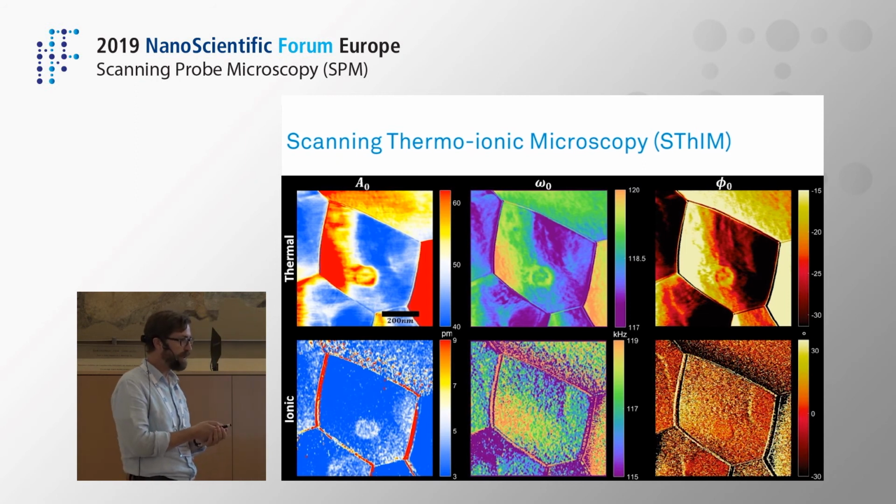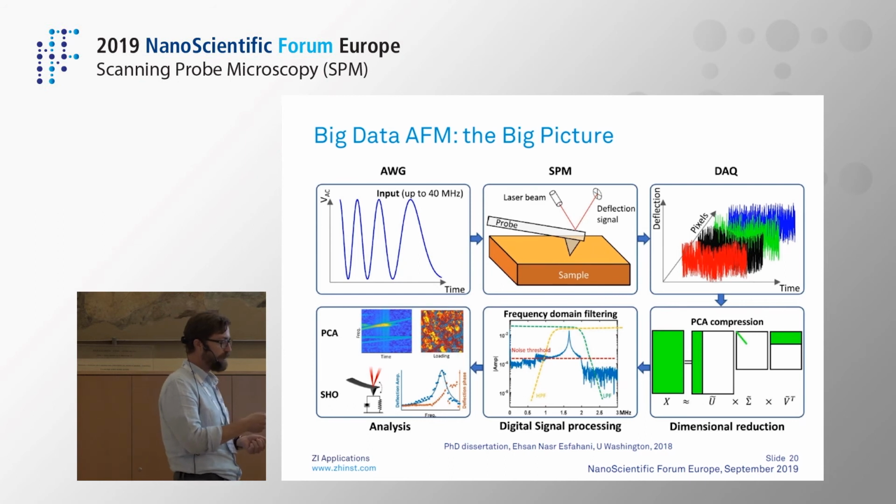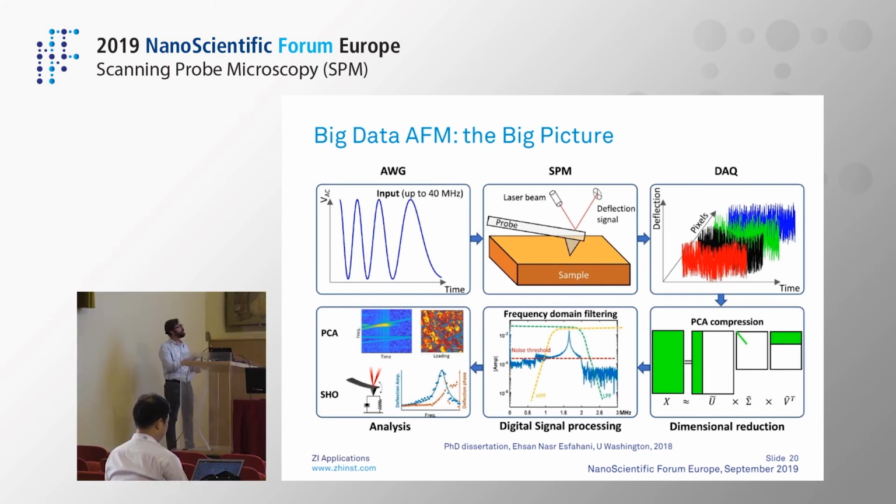But there can be applications for which you want to get the full signal acquisition. In this case, you still start from your mechanical amplifiers that you want to convolute the tip with a sample, but instead of applying a single sine wave or multiple sine waves, we can apply a complete chirp or a type of burst, or other techniques where you can even make a reverse FFT to find the one that you want, and then stream the data.